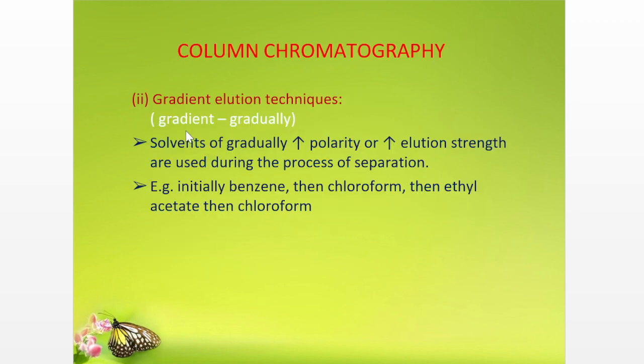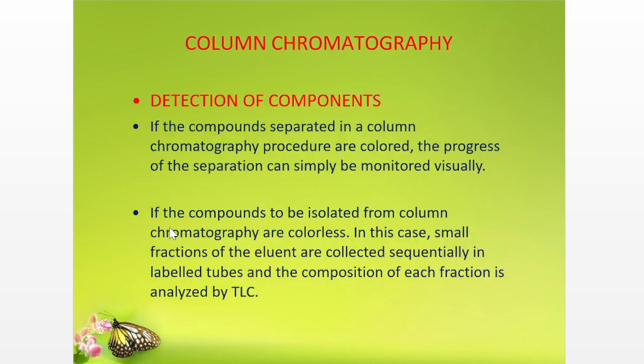Gradient elution technique. Gradient means gradually. Solvents of gradually increasing polarity or elution strength are used during the process of separation. For example, initially benzene, then chloroform, and then ethyl acetate.